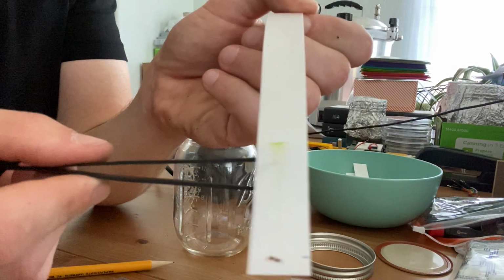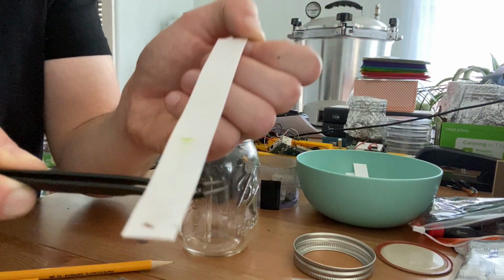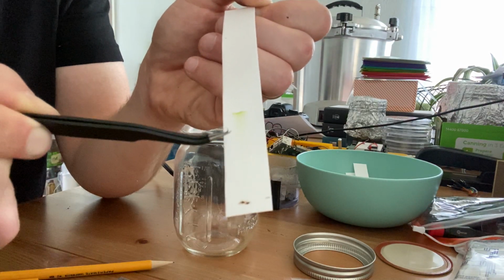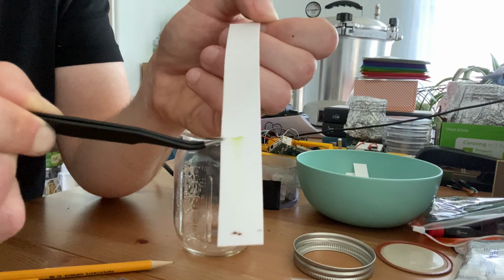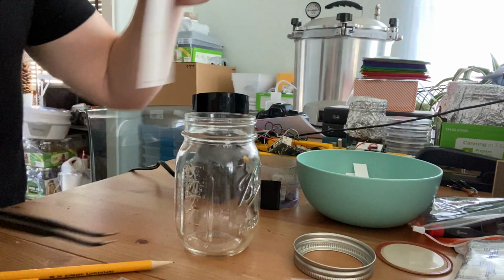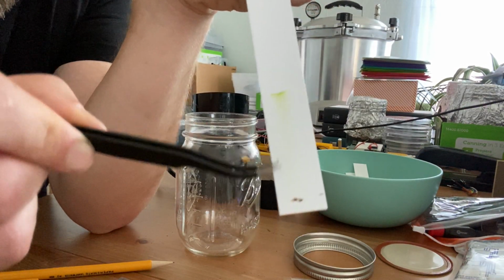So let's take a look at this. What do we notice? We notice that our sample's right here, but we see a gradient here. We actually see a very strong demarcation here, which is the solvent front, and then we see this gradient pattern here. Now, because this technique on this paper is somewhat imprecise, it's going to be a little bit difficult to see all the distinguishing compounds in this particular paper, but we can at least understand the concept and the idea of it. This is the solvent front, this is the origin, and if we were to look at this under a black light, we might actually see more distinguishing features. And we let this dry a little bit more, and as we let it dry, let's see if I can air it out a little bit. You can really get a sense of kind of what it looks like.